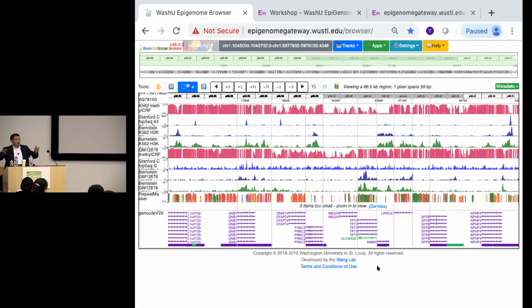Now we can look at multiple things together, to know what the rules are and what the exceptions are. This is putting them right next to each other. If you can do this, you can now do some pretty basic but useful bioinformatics.